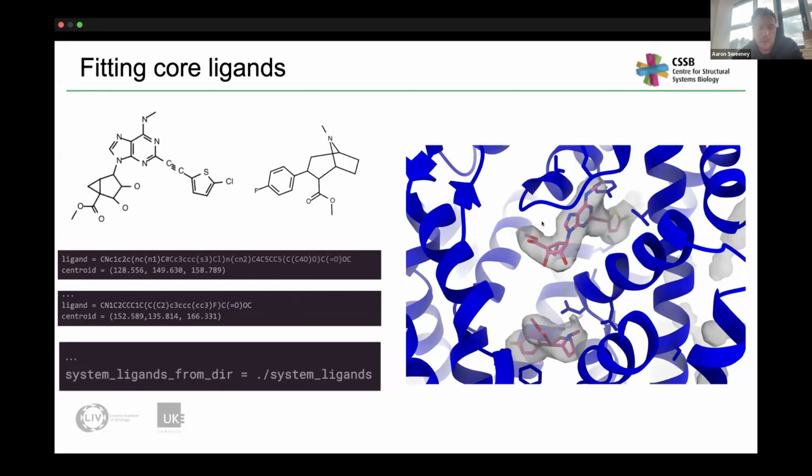Also, another thing that's quite important is when I was running this, if I fit one ligand, and then I wanted to fit the other ligand. During the first fitting, the protein side chains are allowed to be flexible within the binding site. So to track this in my configuration file, I would have to change my protein and then add the ligand. And you can add the ligands by just creating a directory where you throw them all in. And every time you run a new refinement or fitting, it will load up the ligands, and during both docking phases and MD, all the other ligands that are being fit will know that your ligand is there and they'll be able to interact with it, but your ligand itself won't move from how you fit it.